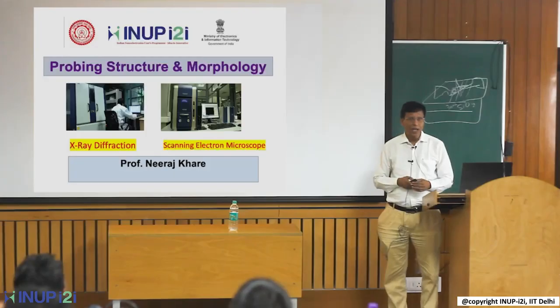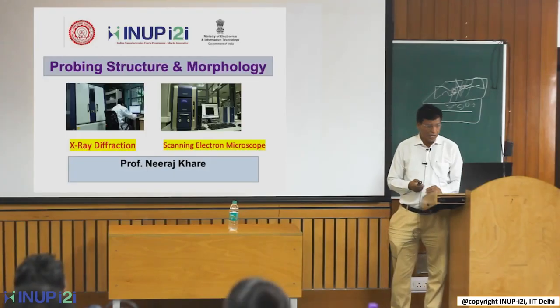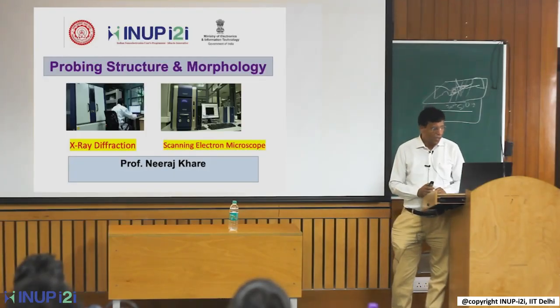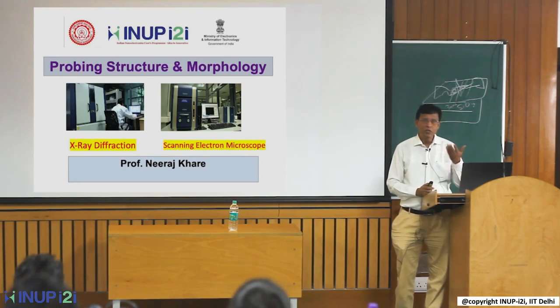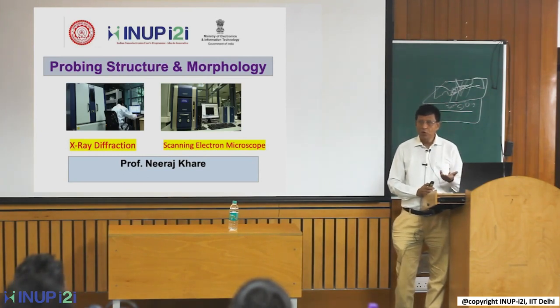That should be the objective — we keep on emphasizing this, and will do so tomorrow in our interaction as well. I will talk in a little more detail about XRD and SEM, and since you are using them, perhaps you can have more queries.